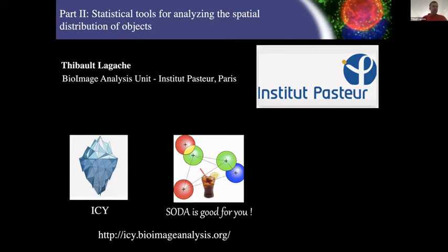I'm a researcher in the Bioimage Analysis Unit at Institut Pasteur. The head of the unit is Jean-Christophe Olivo-Marin. And everything that I will show you today about SODA, the plugin we developed, is available in Icy, a bioimage analysis platform that is free, open source, and can be downloaded through this address.